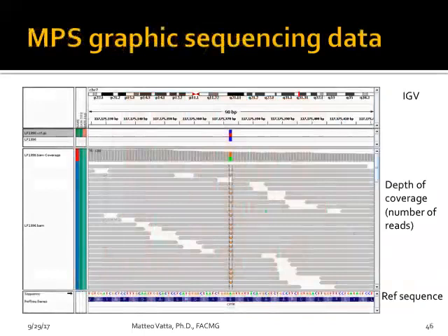Even for whole genome? No, for whole genome, the clinical coverage, even though the limit was set at 40 as a minimum. Okay. Average coverage. 40x unfortunately is suboptimal. You should look at the 80, 75 or 100x, and the minimum 150 for exome. Well, if you want to detect, in addition to sequencing, also other events that I will show you later.